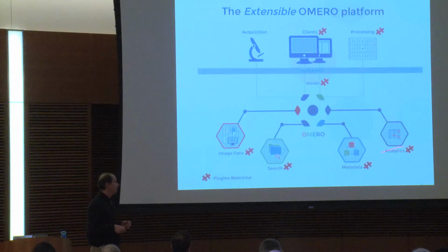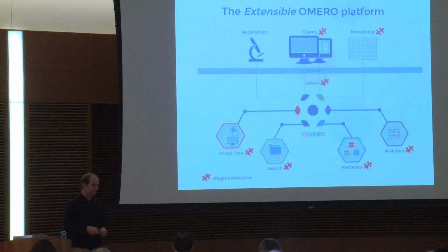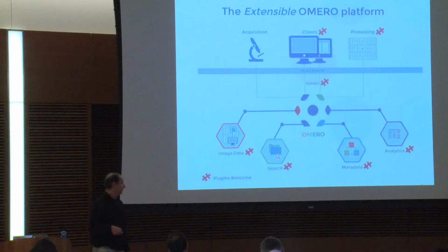So for example, on the metadata side, we are having now a project where we are taking care of a lot of high throughput screening data, and the associated metadata are being uploaded using our own script, the extension, and then a cooperation is being planned with using CellProfiler to digest and analyze all those data with the complicated metadata.